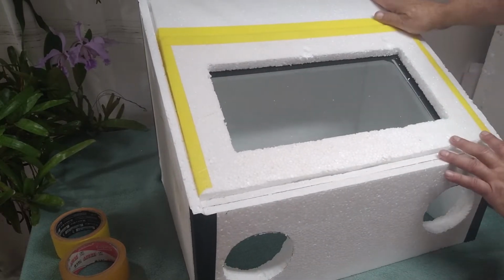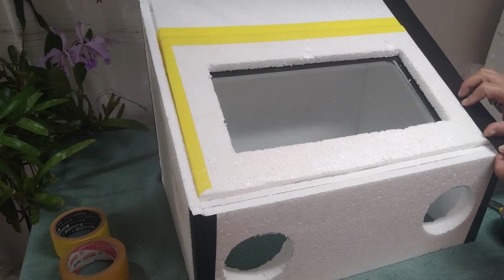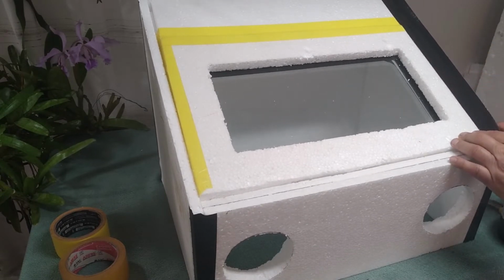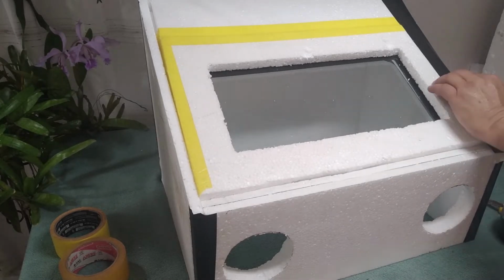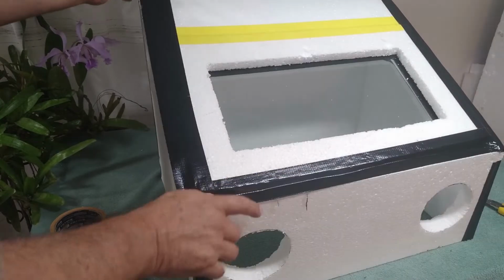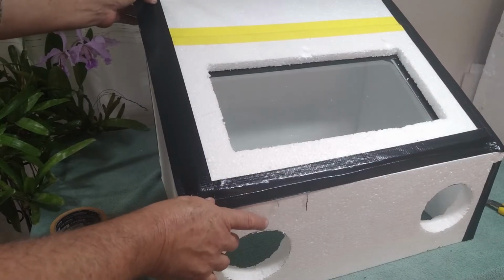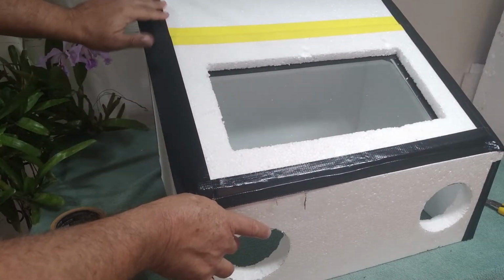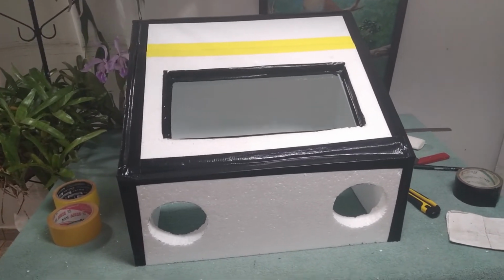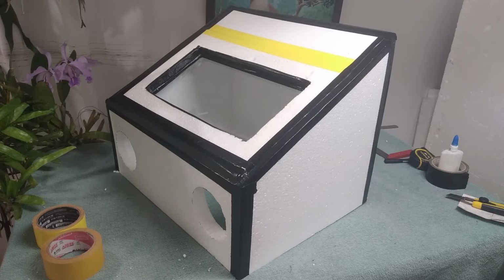After positioning the top in its place, we close and seal every corner with duct tape. You want to tape every other cut edge of the foam so it doesn't start shedding little foam bits.